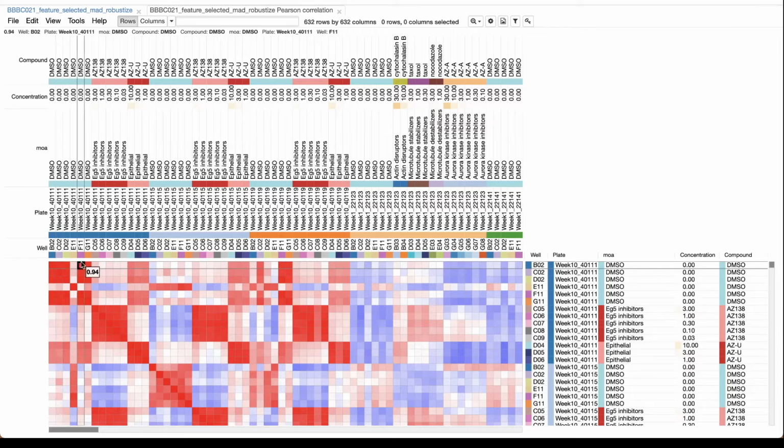Whereas B2 to C5, which I said didn't seem very correlated, has a Pearson value of 0.2. C2 to C5 is a little bit better, 0.29, but about the same. So essentially we're looking at lots of Pearson correlations, with that becoming the value that's graphed.